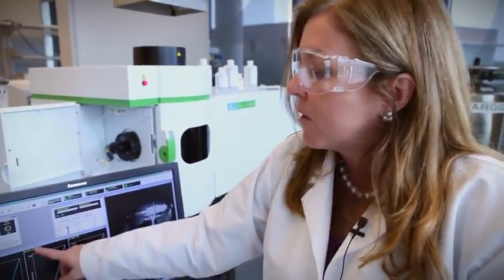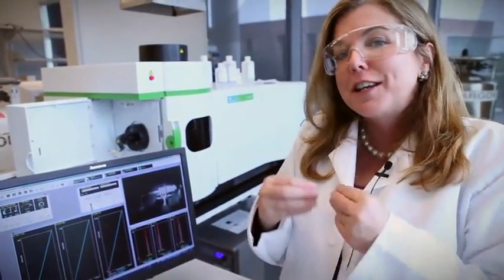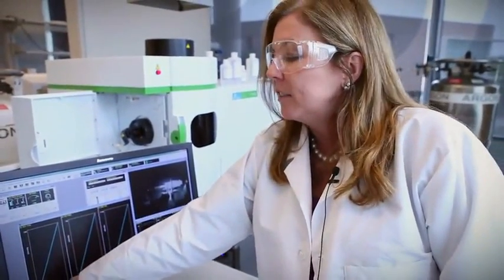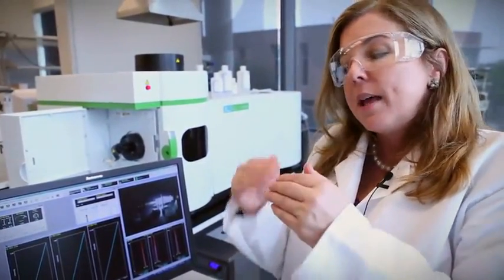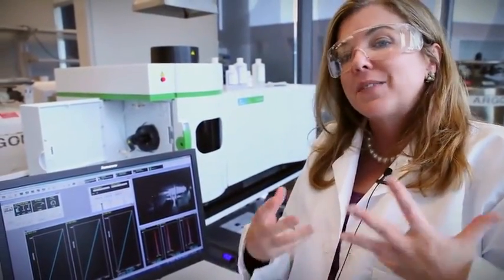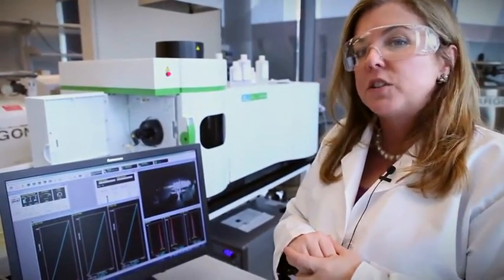And then what you see here is one of the most important features of any metals analysis, and that's the calibration of the instrument. Instruments usually give you a signal, but they don't tell you what that signal means. They don't translate it for you. So to translate it, we take a series of samples that are of different dilutions, a really dilute sample and a really concentrated sample, and we measure how big a signal do we get when we know exactly the amount of chromium we're putting into the instrument. And by changing that over a large range, we effectively translate the instrument signal into the chromium concentration. That's called a process of calibration, and it's a really fundamental thing you do in analytical chemistry, particularly in metals detection.